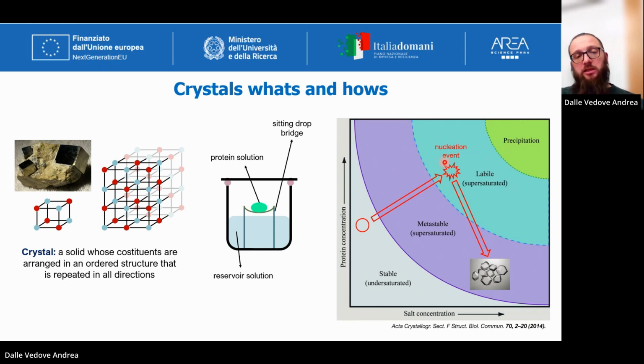These are the very first extremely tiny crystals that then over time grow and hopefully become fully developed crystals that we can use in our X-ray crystal diffraction experiment.